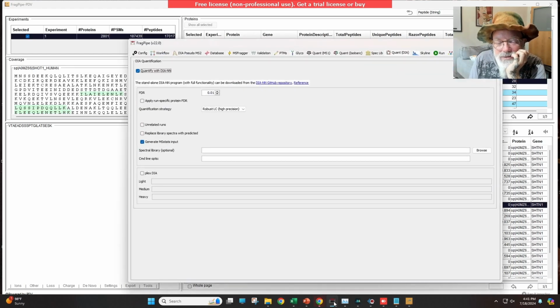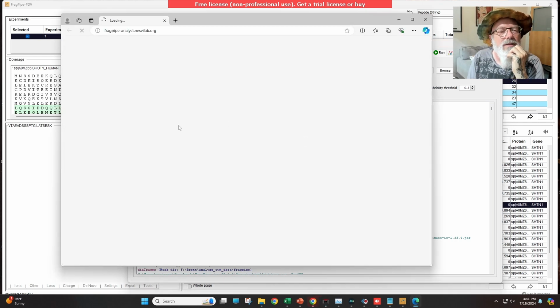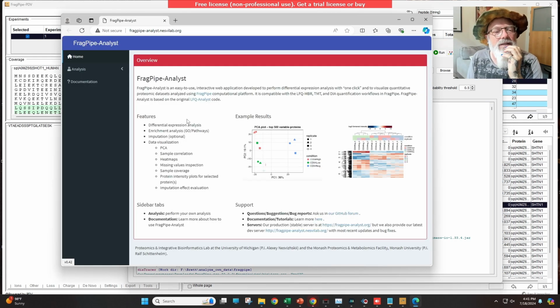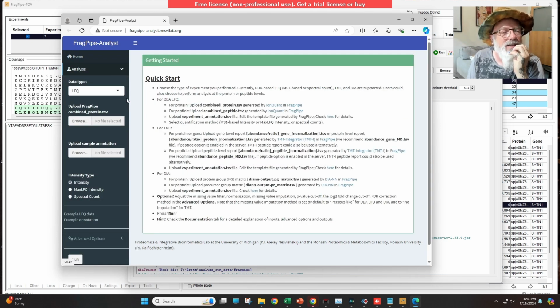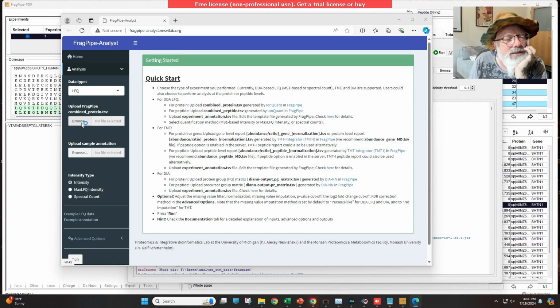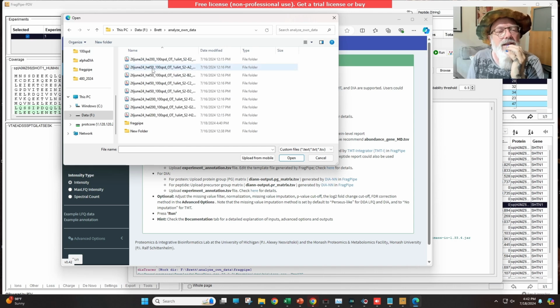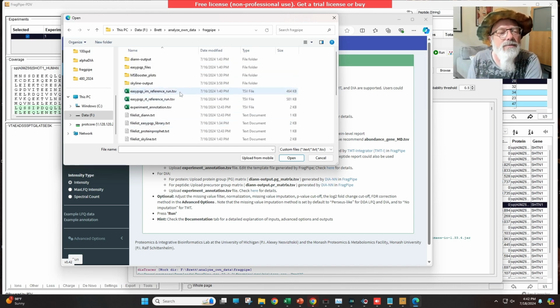Okay, so while it's busy choking and doing that, let's look at, we can also look at FragPipe Analyst. And this can show us some interesting figures about our 50 nanogram and 200 nanogram results. So let's see, we want to do LFQ, I think is what we want to do. Upload combined protein.tsv. So we are going to want to do that here. That should be under the FragPipe.